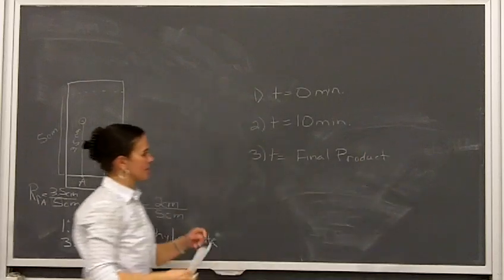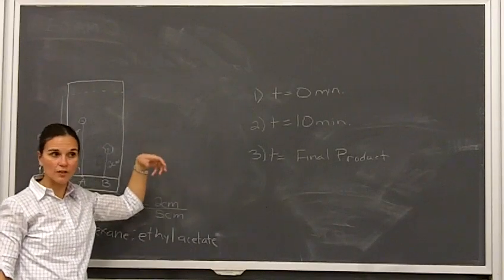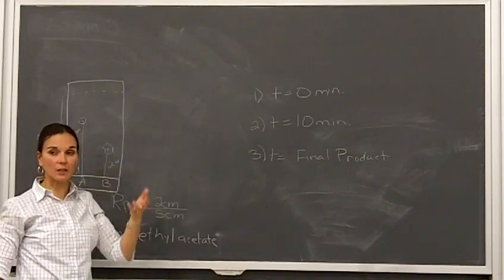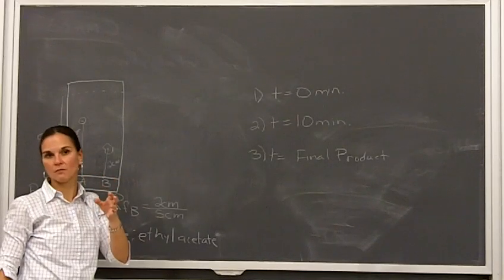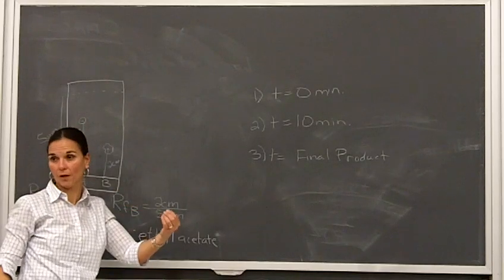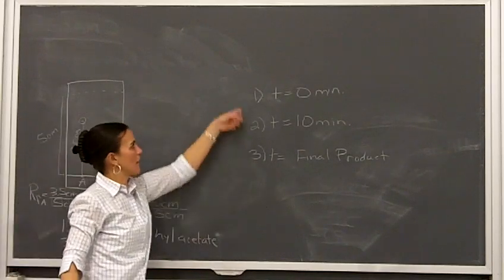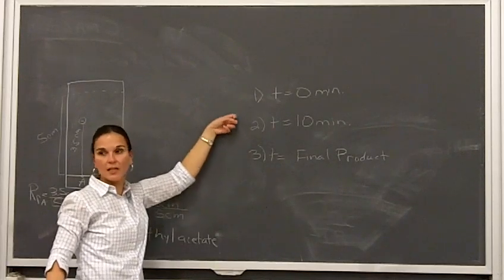When you spot a TLC plate, you can only spot things that are in solution. So if it's a neat liquid, like your alcohol or alkene from the previous experiments, you still need it dissolved in a solvent. Here we've got what you're interested in dissolved in a solvent, because it's a reaction in ethyl acetate.